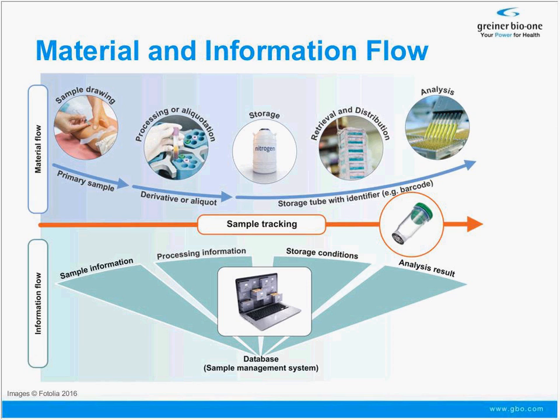Next to this material flow, there is also information flow. So when saying information flow, we think about sample information, processing information, storage conditions, and also analysis results, which all can be captured at certain stages and can be stored in a database. And sample management systems are, for instance, a means that is often utilized for this purpose.